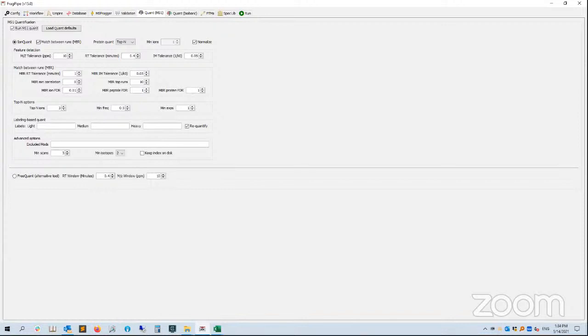So that still needs to be explored, how to do it best, but it's a really good question. So I'd say explore going to 2%. But think about what downstream analysis you're doing and whether that analysis requires really high confidence quantification data, or it can tolerate some outliers and poor quantification, because you're just interested in pathway level analysis, for example. That's okay in that case.